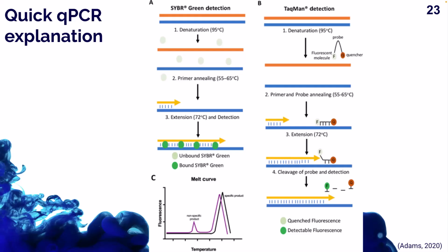your amplification is only as specific as your primers. So we decided to go for the TaqMan approach, which is where we have a primer and a probe, and you're getting more specificity because your primers and probe must match in order for it to attach. And then once it gets extended, that probe kicks off and fluoresces. And that allows that specificity and our quantification.